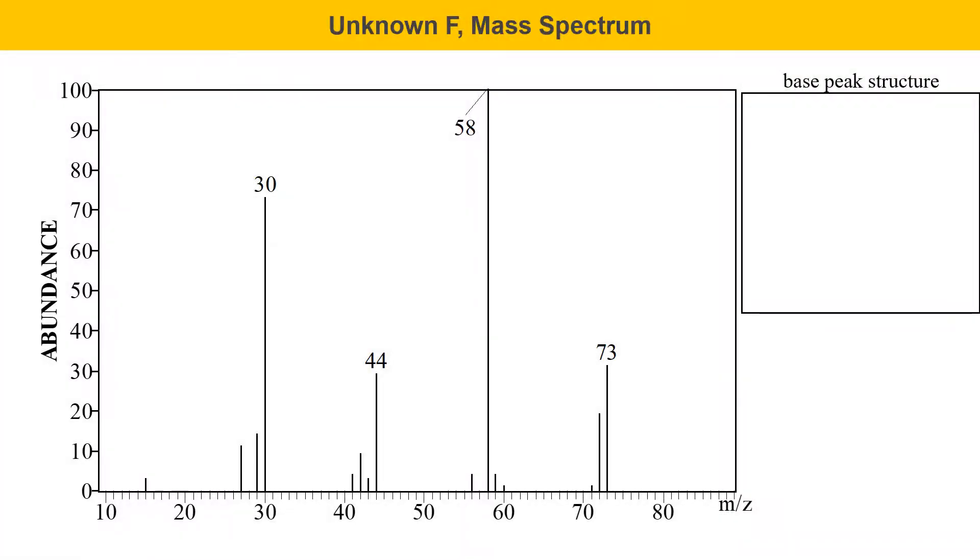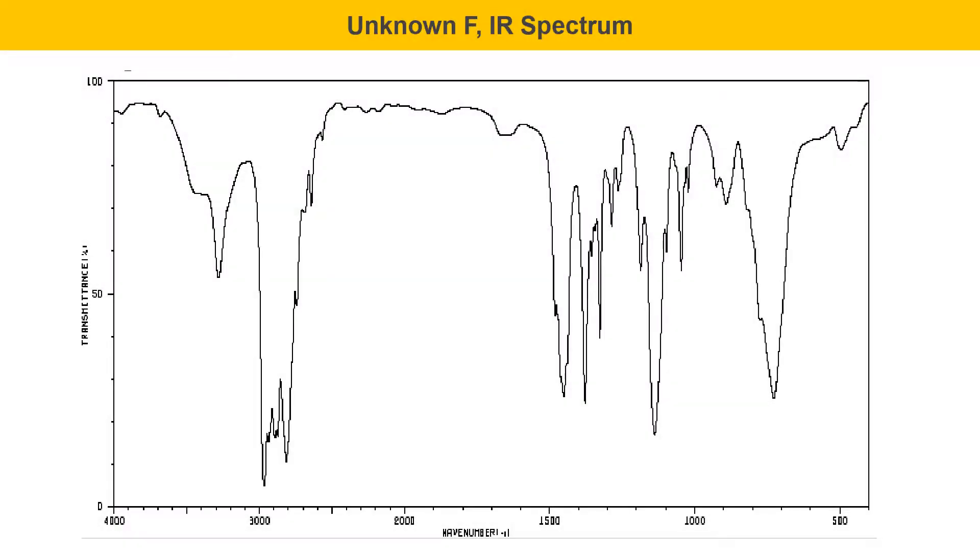And moving on to unknown F, here's a mass spectrum for unknown F. One of the things that's significant here is the molecular ion is odd. That's something to take note of and try to figure out what it's telling you. Here's an IR spectrum of unknown F.